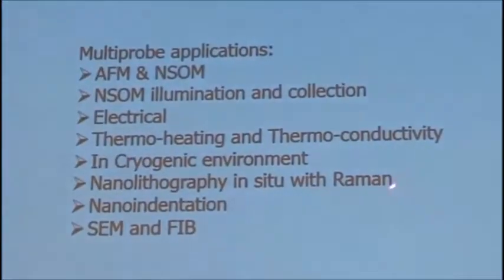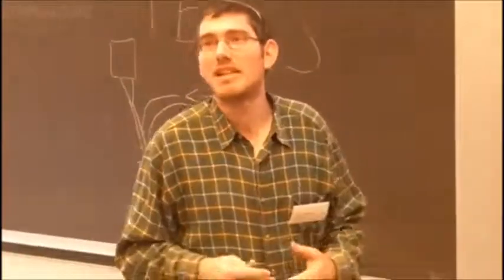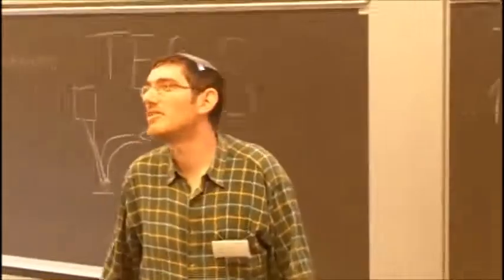Nanolithography together with Raman, nanoindentation, and there are more and more applications of this, integrating whatever you can think of.